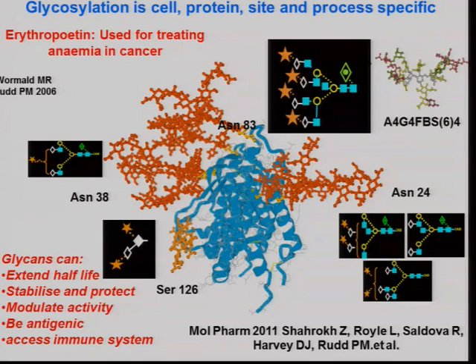Well, they do. There's a few, I know Roche, they use LC, and they use 2AB labelled LC. Dietmar Reusch did his PhD on this. He studied every glycoanalytical process that there was in order to decide which to use in Roche, and they ended up with the reverse phase, and their bog standard one is what we use, 2AB. The main reason they use it is because it's actually analytically more information. But the other reason is if they do mass spectrometry, they have to take the sample from the production lab, send it over half a mile over the other side of the campus, put it in a queue, probably get the answer back 3 days later.